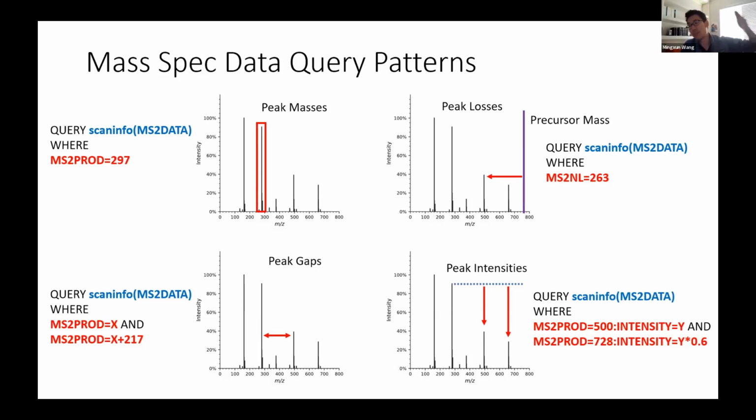And this can be across MS1 and MS2 data currently. So you can have some pattern, like an isotopic pattern, for example, that's unique across MS1 and even across adducts. And then you also coincide a pattern in the MS2. So whatever little bit of information you know about what you're looking for, it allows you to inject it at exactly the right place.